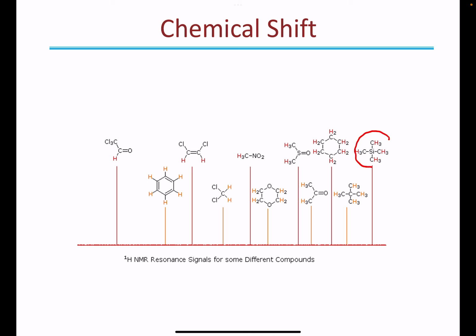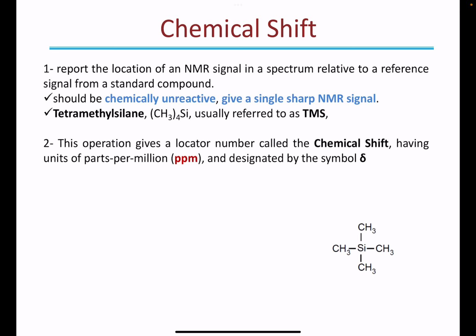The reference substance, tetramethylsilane, will give you a value of 0, and as you go to the left, the number will be higher. The number will give you information about the chemical environment of the different protons, which can help you identify your chemical structure or the organic structure.